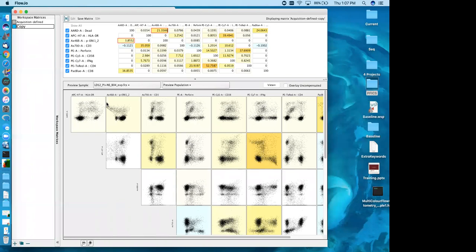One of the main reasons not to try to make an adjustment here is that what you're actually doing when you're adjusting the spillover amount between two colors is telling our algorithm there is less of a given color than was thought previously, that was calculated. And so that becomes then factored in for every one of these interactions that use a given color. And so whereas you might make one plot better, or in this case dramatically worse, sorry, you will actually probably affect many, many other plots. And so you might be able to make one slightly better at the expense of making others much worse.